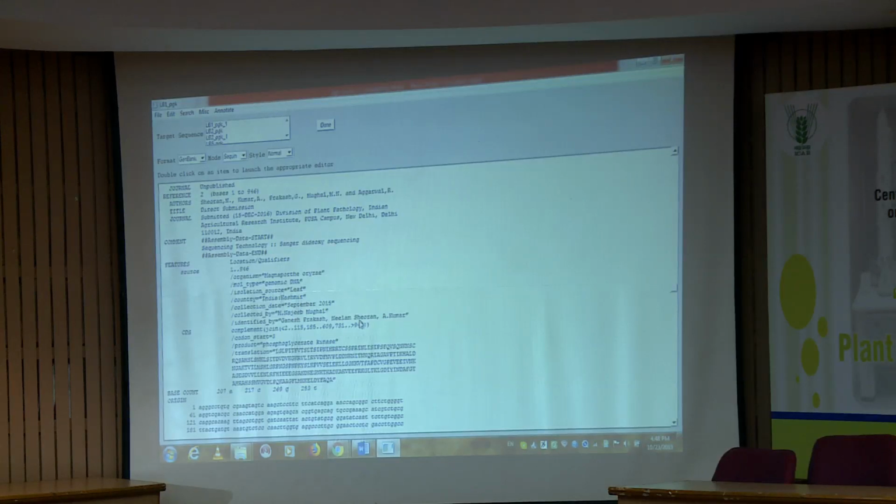But if you are going with the gene wise, then you have to specify this thing, right. Once you specify that, all the stop codons will be eliminated from the sequence. In nucleotide, you had seen some stop codons coming in between, because wherever your coding sequence ends, there you will get one stop codon. Here that has been taken care of, and not a single stop codon is visible, since we have mentioned the coordinates of the coding sequence only.